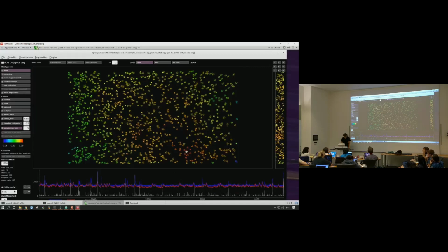Now let's switch to a different activity mode. We'll just take the neuropil corrected traces. F is the trace of the cell, that's the blue trace in the bottom view. Red is the neuropil, so Fneu. And then the neuropil corrected is the third one. That's the default you get when you load Suite2P. We're going to go back to it.